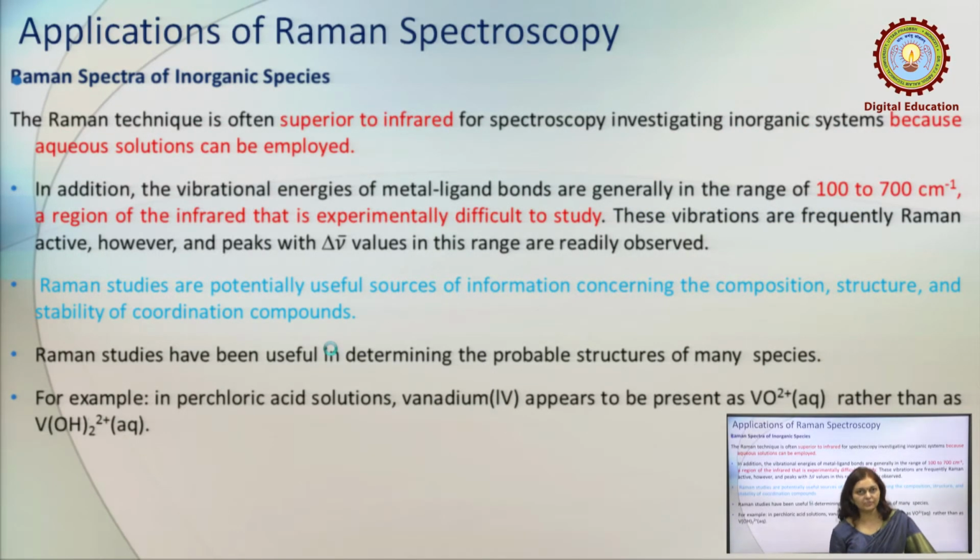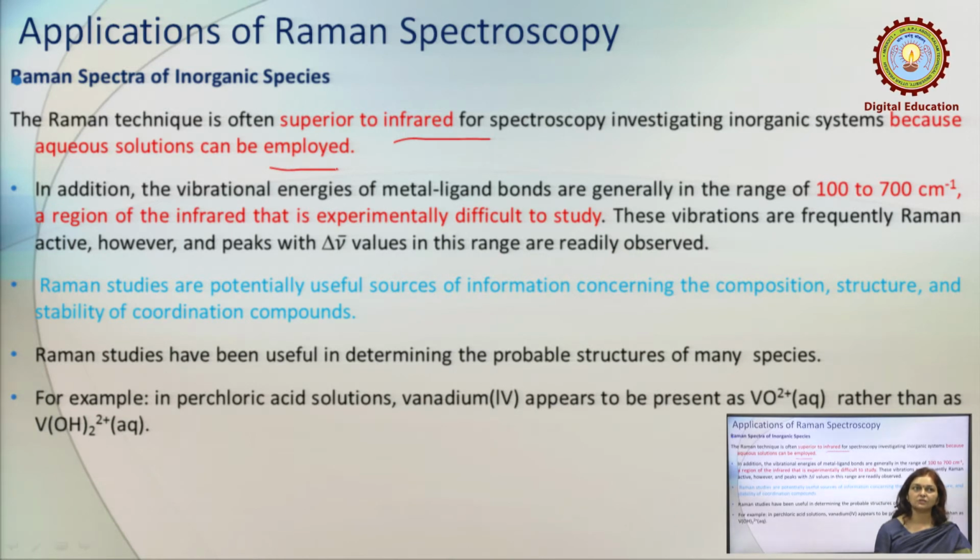Now, after instrumentation, come to the application part of Raman spectroscopy. Raman spectroscopy is an important tool for the study of inorganic species because it is superior to IR spectroscopy for investigating inorganic systems, because aqueous solution can be used in the case of Raman spectroscopy while it could not be used in the case of IR spectroscopy.